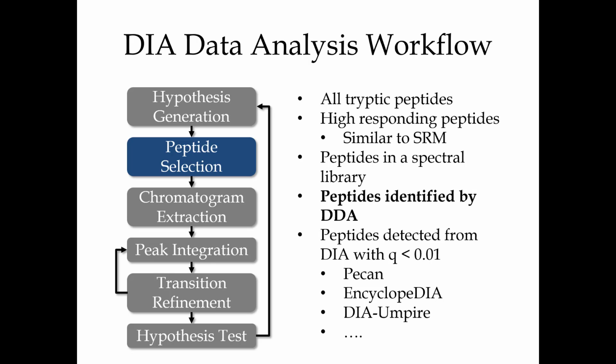So in the end, you're quantifying out of some peak area, right? Which is a retention time. This is intensity over retention time for a specific fragment in this case. So it could be a precursor ion, where you've got an MS1, or you get a specific fragment, which can have much lower noise. A fragment is more selective typically than a precursor. So you're going to have much lower noise, and hopefully we'll keep working on that. Keep going through that. But yeah, so the DDA, and you'll definitely get to see how that works.